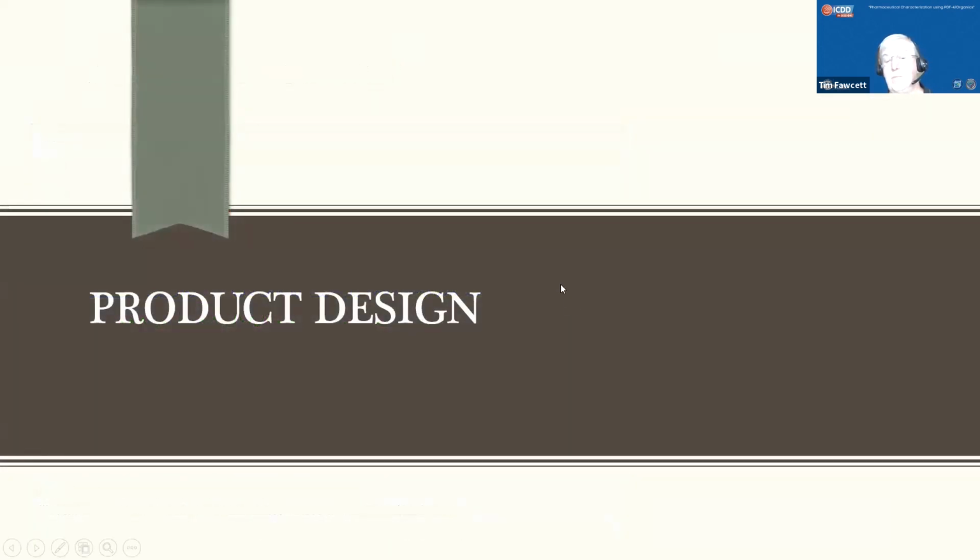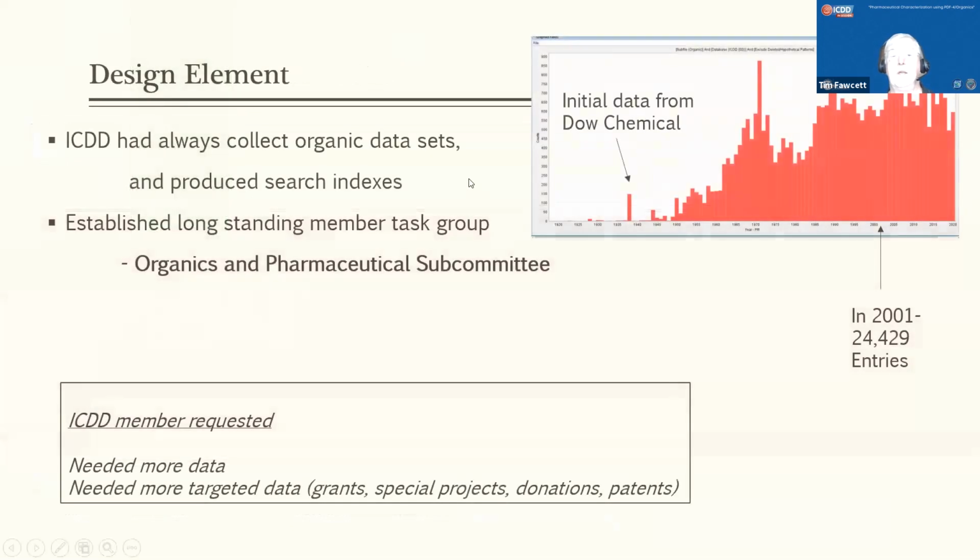Now I'm going to talk a little bit more about the product design. Organics have always been part of the Powder Diffraction File, even since the 1930s and the original 150 patterns that came from the Dow Chemical Company. And there's been a long-standing group of people that have been ICDD members that work in the pharmaceutical industry that are part of the Organics and Pharmaceutical Subcommittee. And they helped get data into the database from those early years until we had 24,000 entries in 2001.